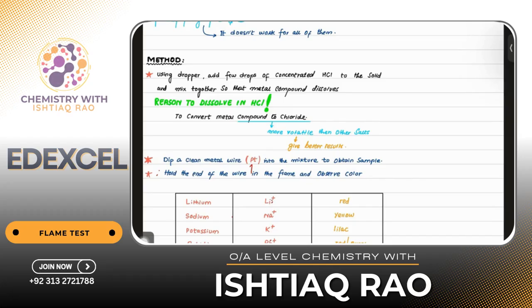And if it would not burn, it cannot give you energy, so we cannot run the vehicle. So it is necessary to have a compound with fewer carbon atoms, which can burn easily and give energy easily. The same goes for this. We need a compound which can burn easily, which is more volatile in nature. This is why we add concentrated hydrochloric acid to the solid and mix together so that the compound dissolves. It gives better results.